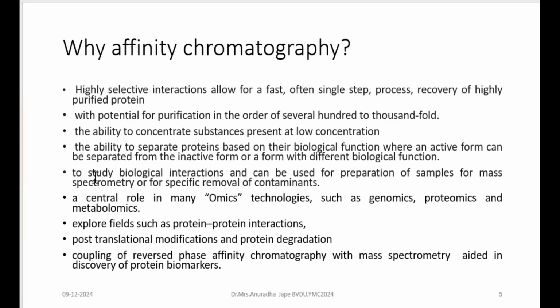The reason is that affinity chromatography is highly selective in its nature, right? The interaction is very specific. And because it is specific, it is very fast. It is going to be completed in a single step, and you can have recovery of highly purified protein.